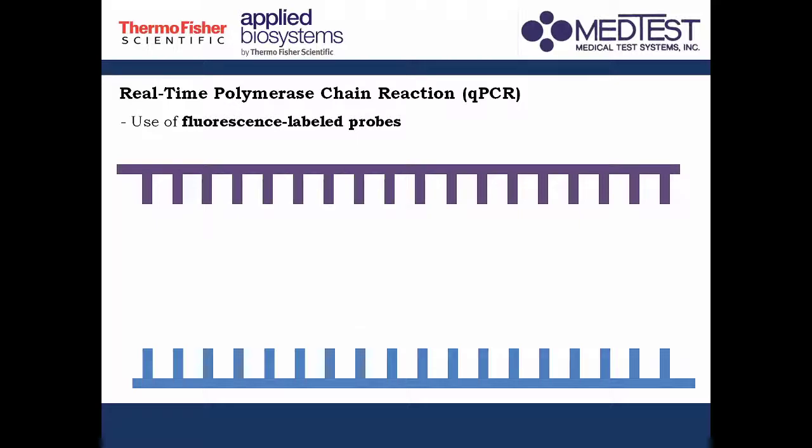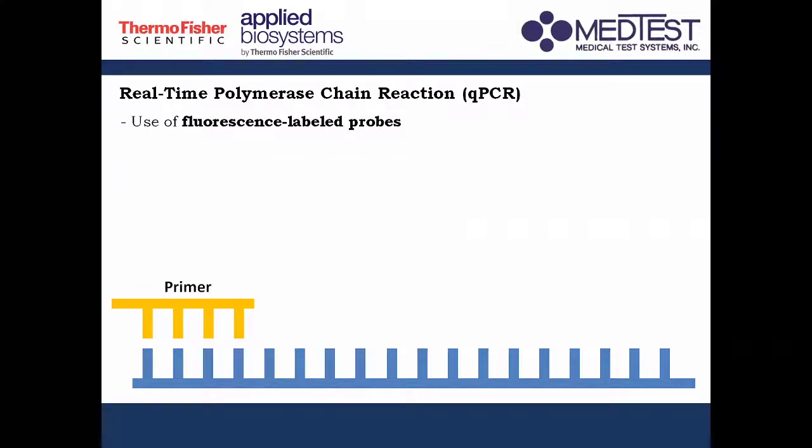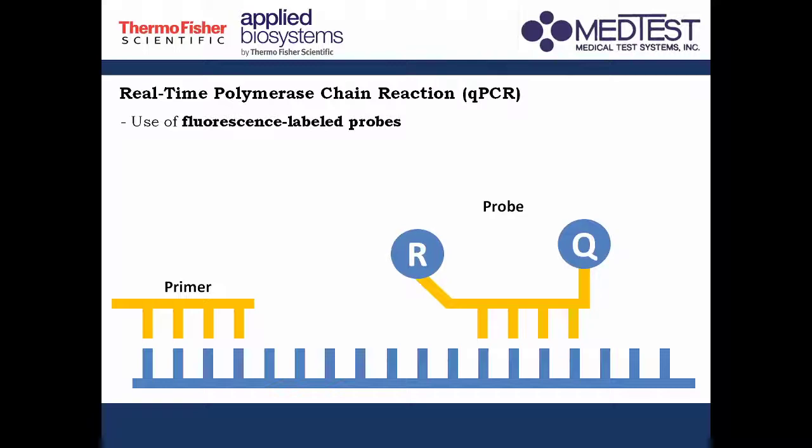So kailangan tong i-denature yung DNA for you to be able to make copies of your DNA.